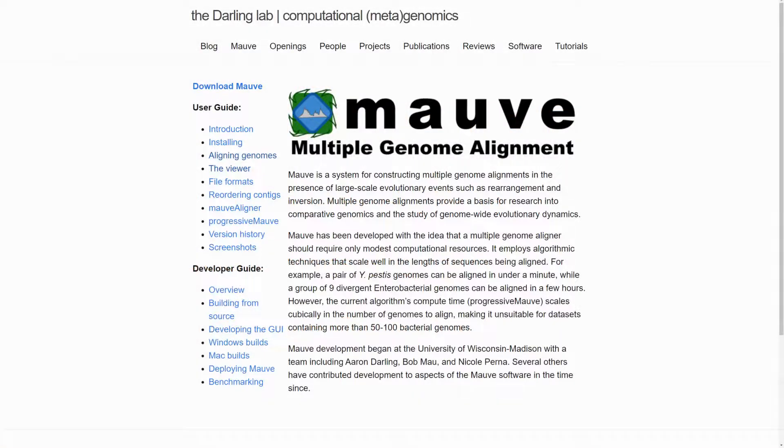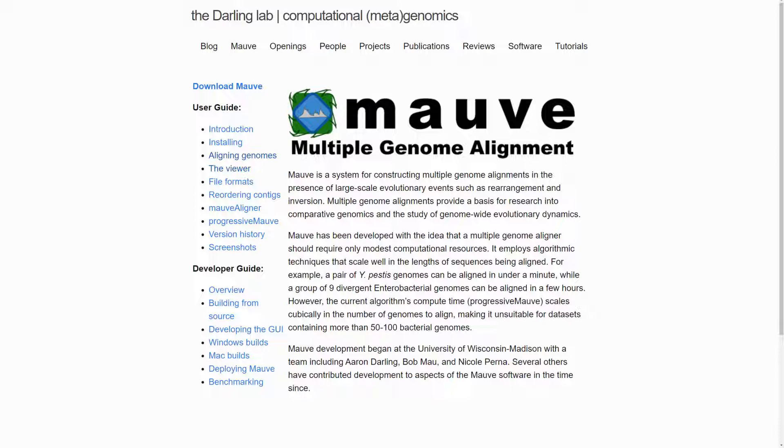MOV is developed and maintained by Aaron Darling at the University of Technology, Sydney. The program is designed for constructing multiple genome alignments in the presence of large-scale evolutionary events such as rearrangement and inversion.